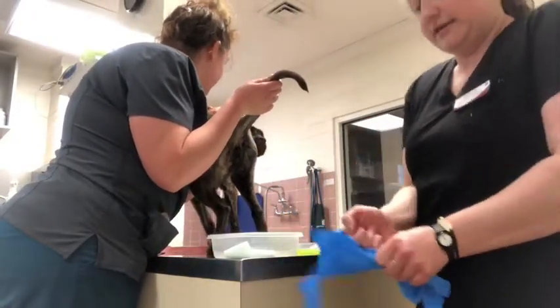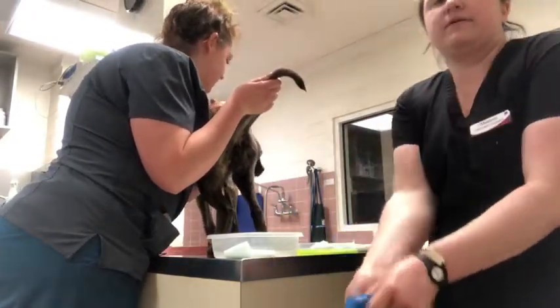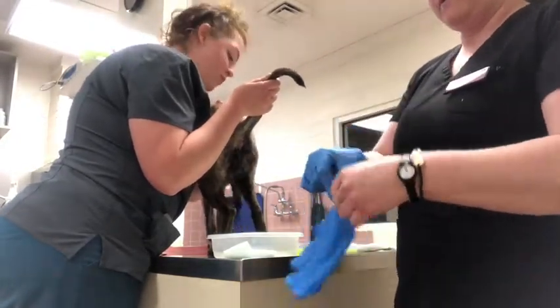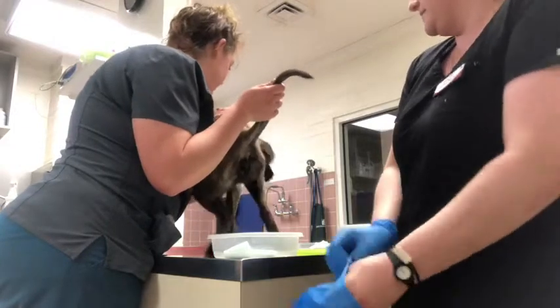So I'm going to demonstrate collecting a sample for a vaginal cytology to determine what stage of estrus color is in.